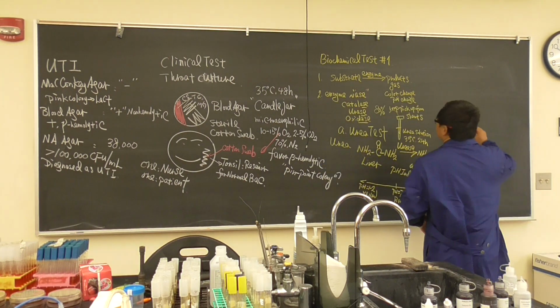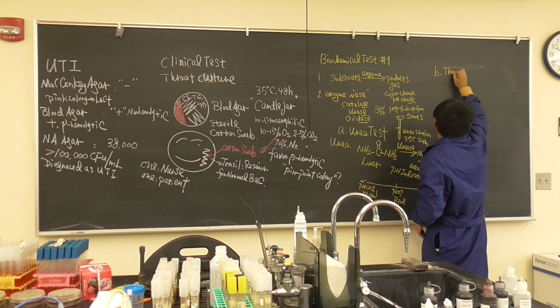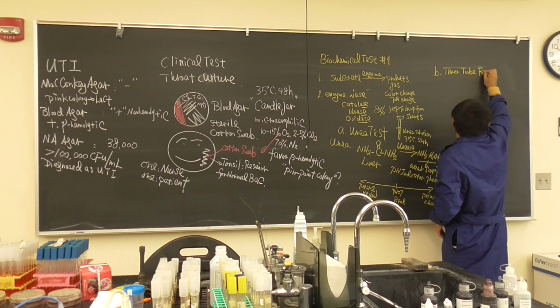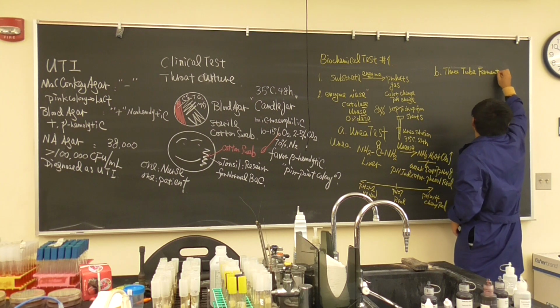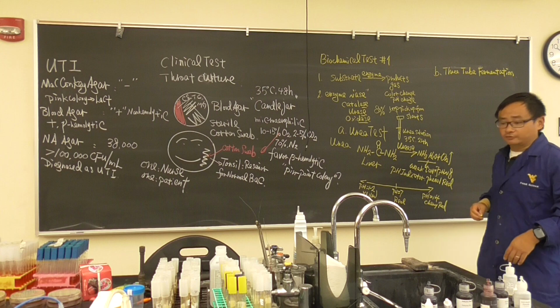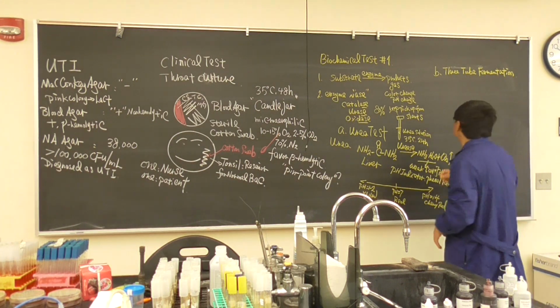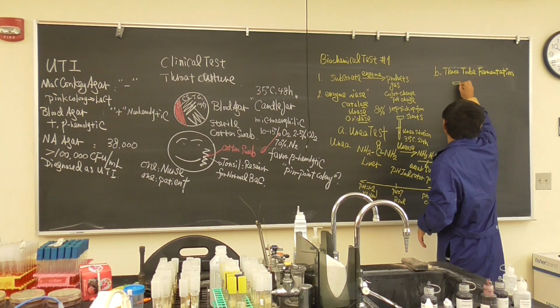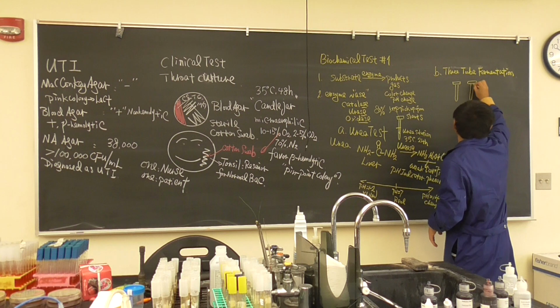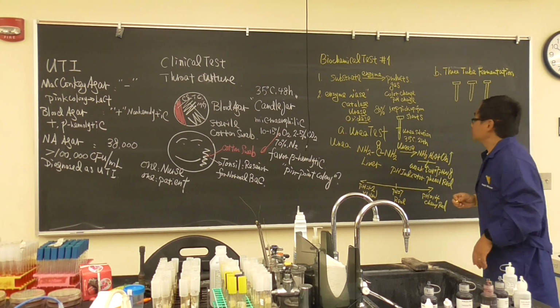Okay, so the second test is the 3-tube fermentation test. We will talk about the fermentation in great detail in the lecture. So what is the 3-tube fermentation test? We have 3 tubes right here. In today's class, it's a little bit different from the fact sheets because we don't have enough material.